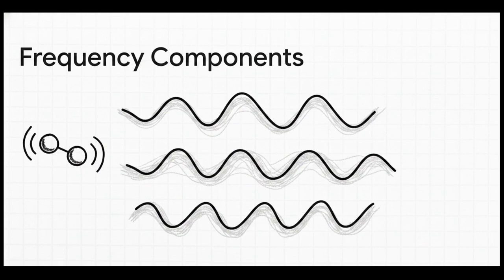Now, when we factor in that the molecule isn't just sitting still but is actually vibrating, its squishiness, or polarizability, changes as it moves. Expanding that previous equation using basic trigonometry mathematically proves the existence of our three exact frequency components. We literally get a beat frequency. The math spits out the original frequency for the Rayleigh line, a subtracted frequency for the Stokes line, and an added frequency for the anti-Stokes line. It's just a gorgeous alignment of classical mathematics and observable physics.